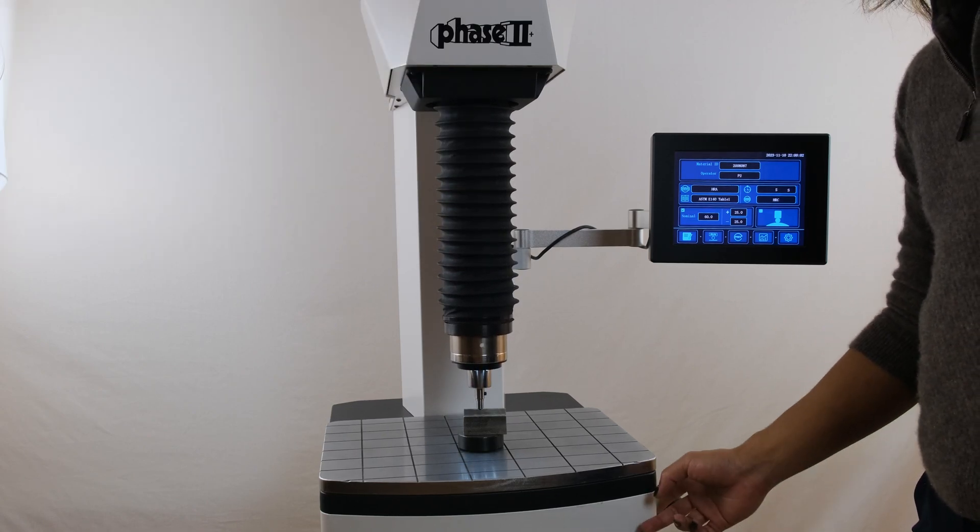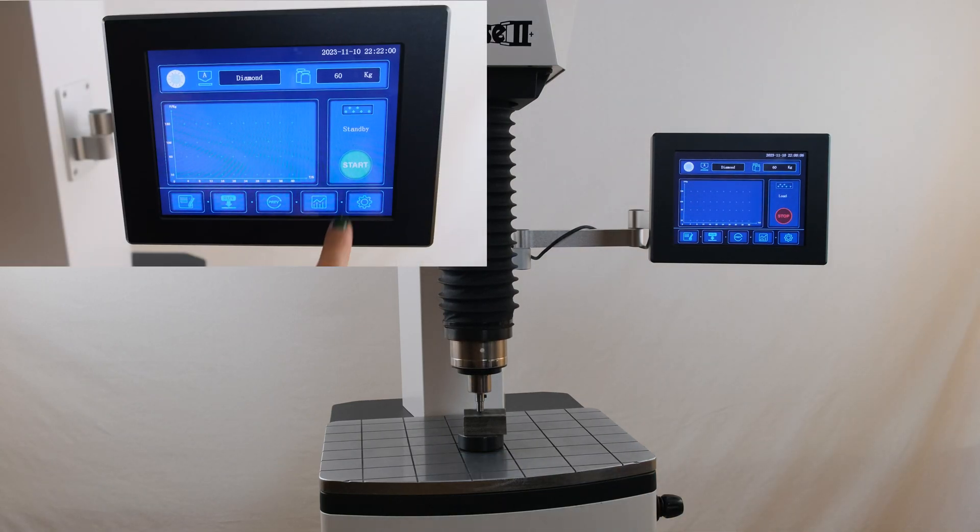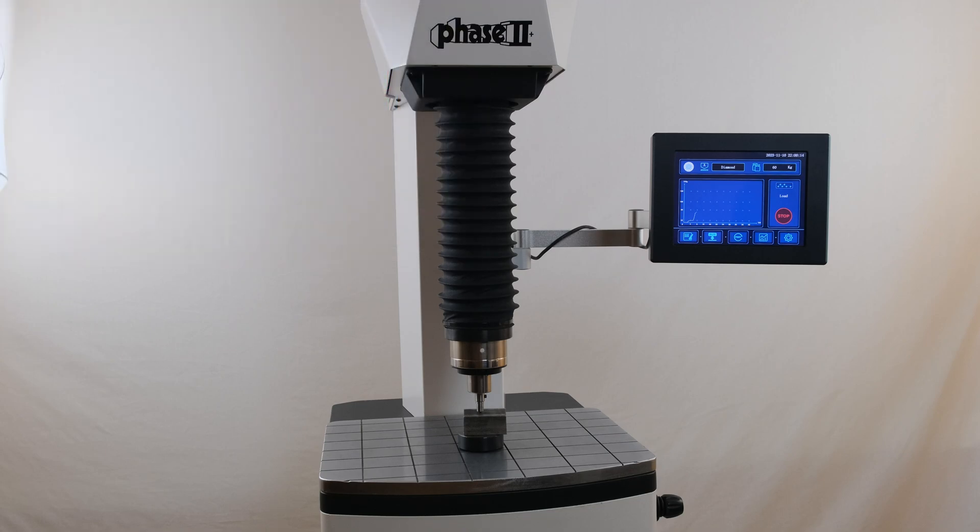The test is initiated by pressing the start button either on the side of the machine or under the second test run menu. The tester will handle the rest of the testing procedure on its own, moving the indenter head from any height above the part to complete the test.